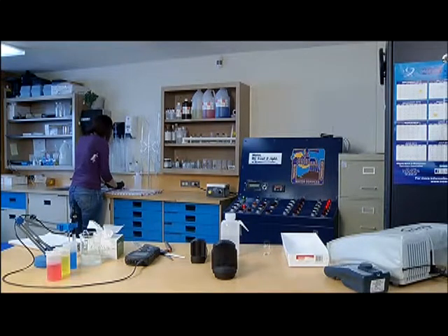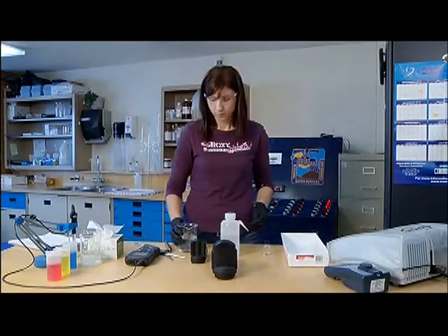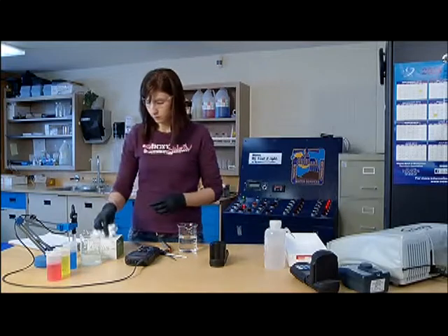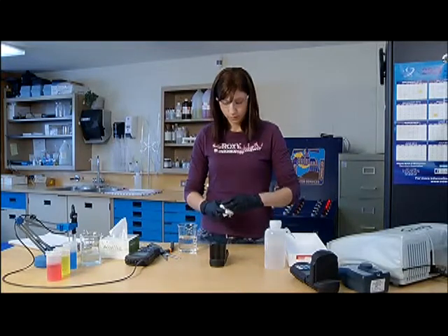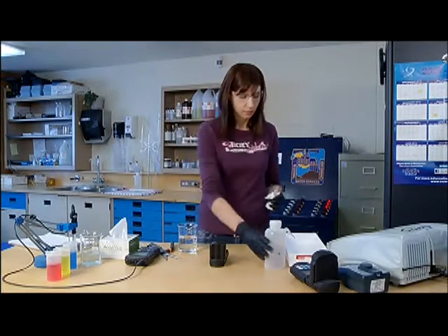Ensure the testing colorimeter being used is in good working order and has a current calibration as prescribed by the manufacturer or regulator. In this reminder, the operator is using a handheld colorimeter for the test. The same principles discussed in this reminder video apply to using a larger bench-based device.